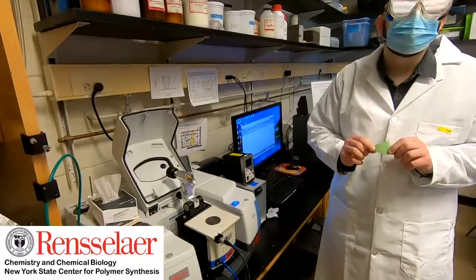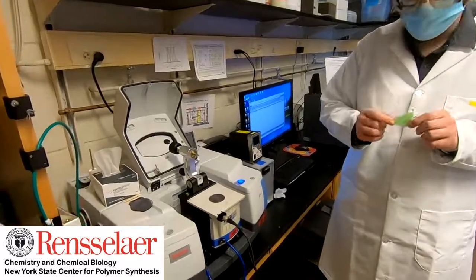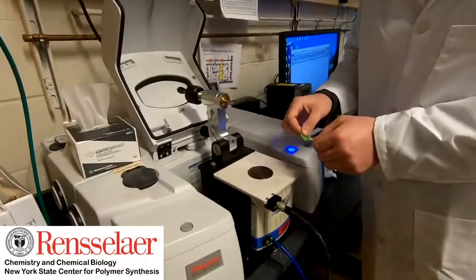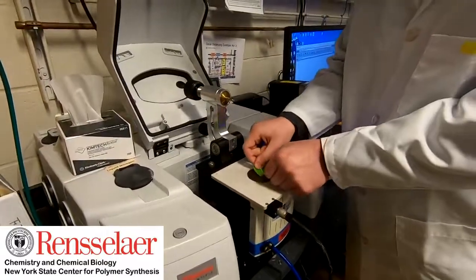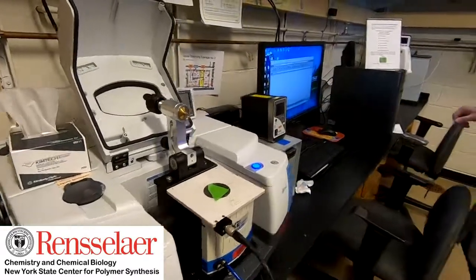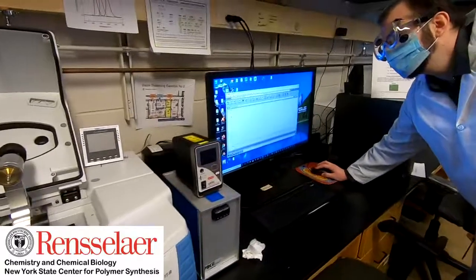So we're going to measure adhesives that are found on common household tape. All you have to do is put it above this sensor here in the middle. And then we can run the IR spectra.